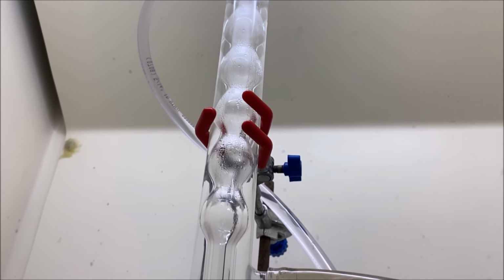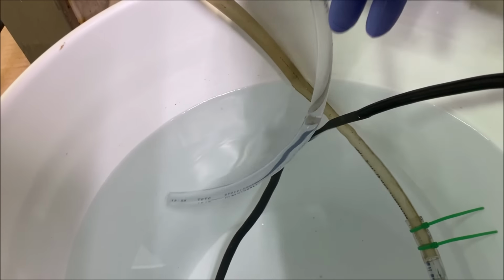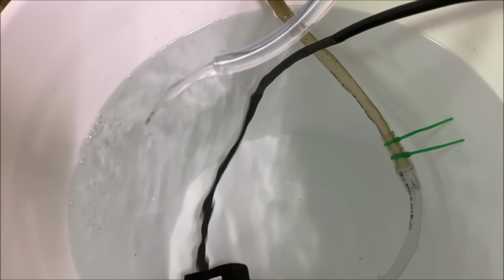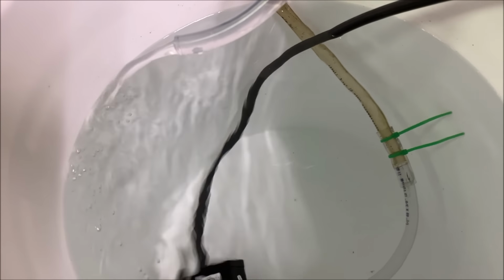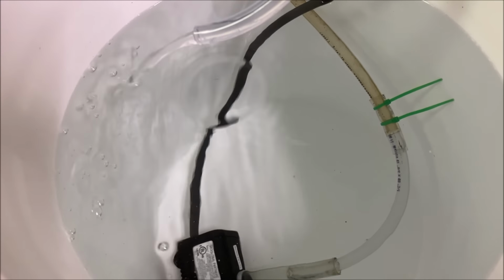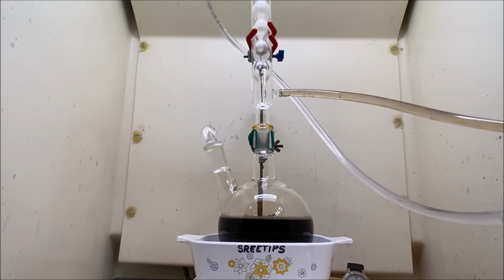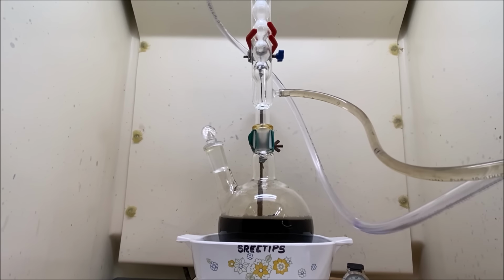This reflux condenser setup worked beautifully. And what I did is I just kept this bucket full of ice, and it had a nice water flow, cooling flow going to the condenser. I'll begin by disassembling our rig, turn off the pump, removing the hoses so we can drain the water out of our condenser.